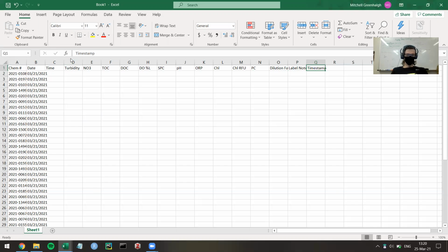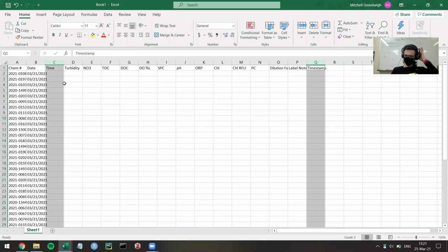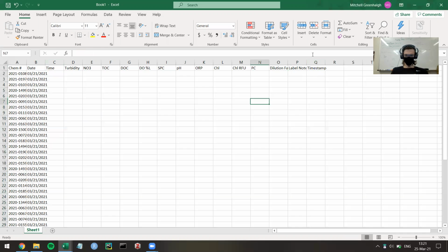And then this is the timestamp from the scan console. Originally, what we're supposed to do is take this time that we've written down and compare it to the timestamp, and correct this time if the timestamp says otherwise. But it's more accurate and easier to just bring in the timestamp, transfer the time from the timestamp over here and then move forward. So that's the part that I'm going to do next, this timestamp part.